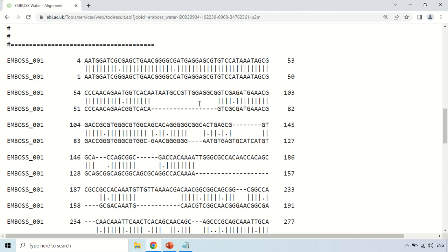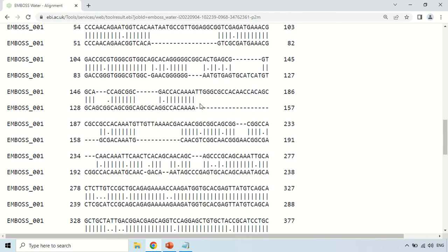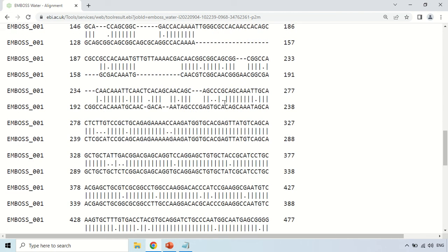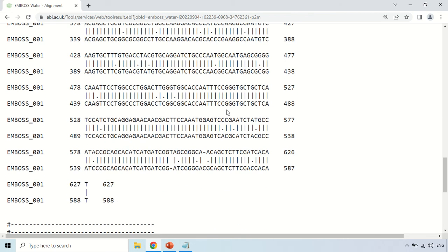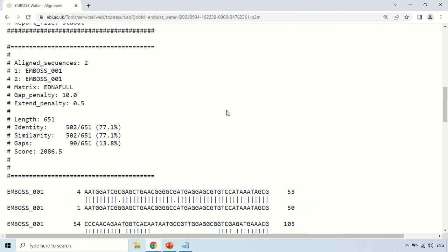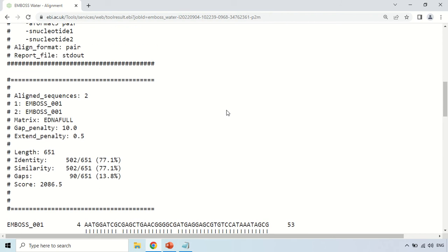By this you can see the complete results of your pairwise alignment and use them accordingly.